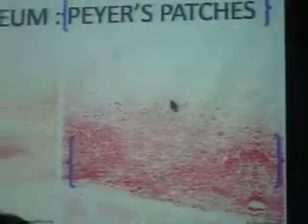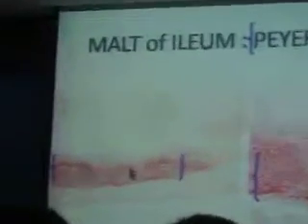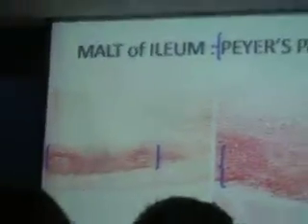This is the slide that we have. Every dot there is a lymphocyte. This is the lining epithelium, simple columnar epithelium, and we have the mucosa layer there. What are M cells? Dome-shaped. In the area where you have lymphoid tissue, you may see M cells. Remember, it's associated with the lining epithelium. What's the lining epithelium of your intestine?